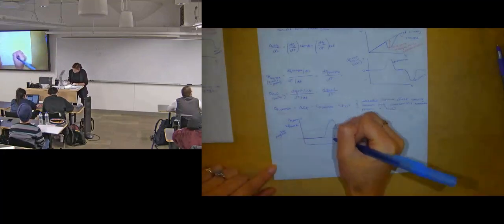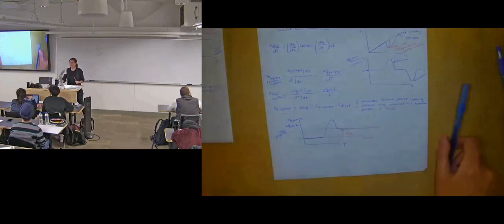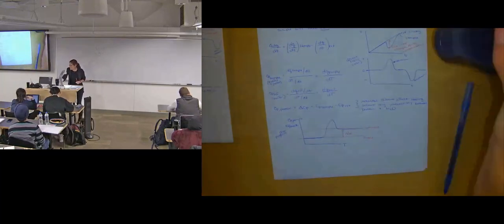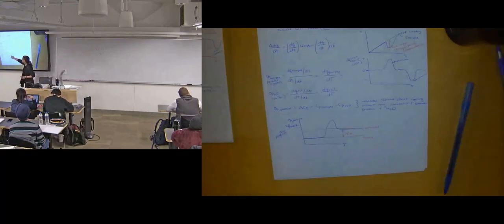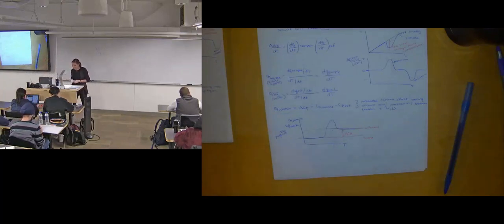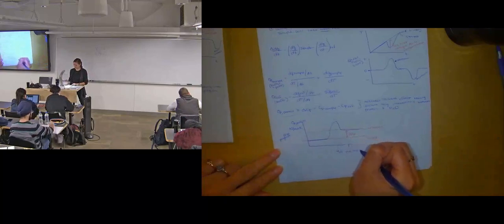What did we call this temperature here? At the top of the peak, the peak of our CP curve, we called it the melting temperature. So if you're melting plastic, it makes more sense. Like, I'm literally melting it. I'm going from a solid to a liquid. In this case, we're talking about denaturing. Okay? We're at the unfolding state, but we still call this T sub m, or the melting temp of our protein.